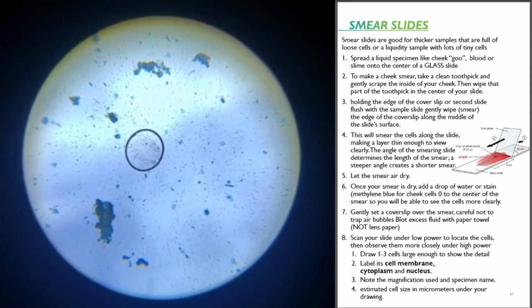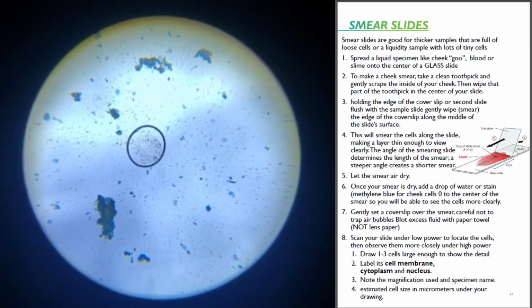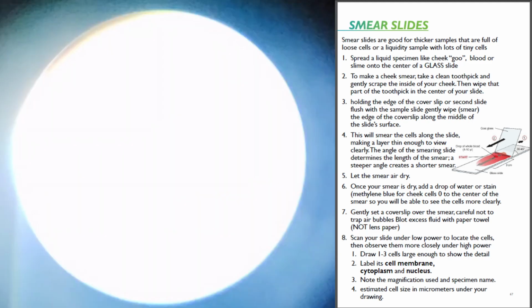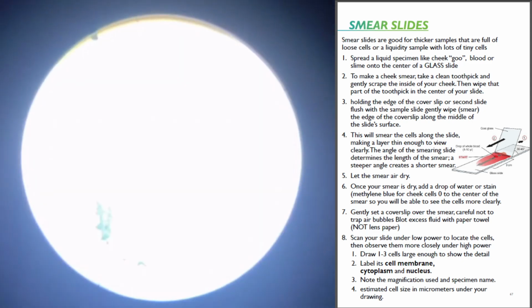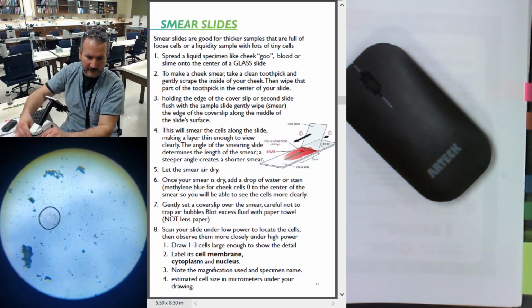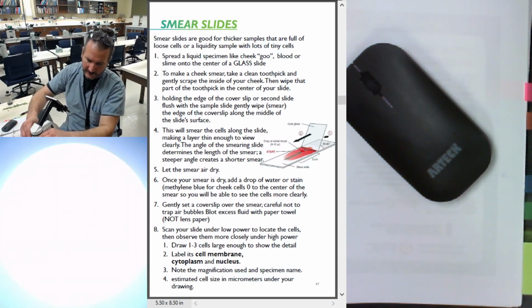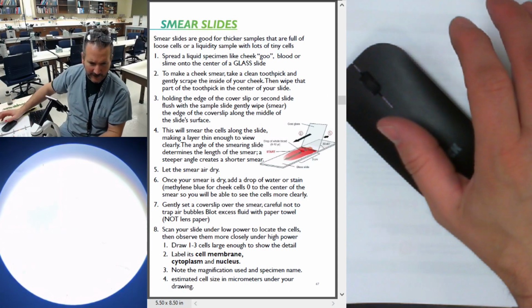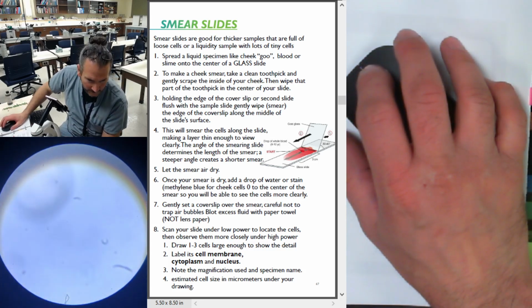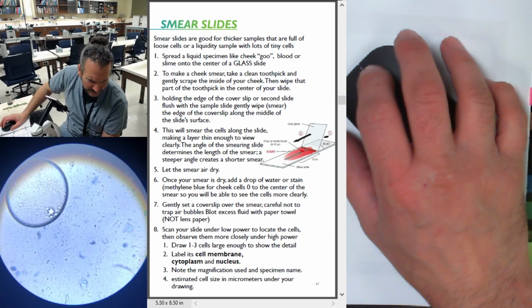Alright. So we're pretty clear. Let's go ahead and flip our rotating nose piece. Alright, I'll come back here while I'm doing this. Turn the revolving nose piece right here. Now we're on the 10x, low power. Oh, big bubble.